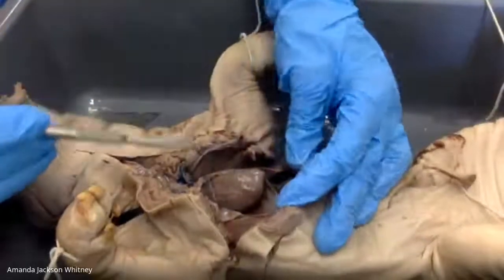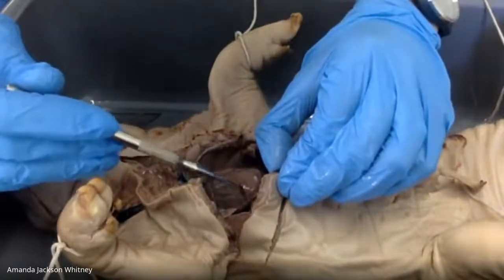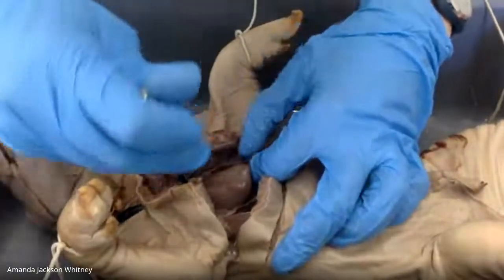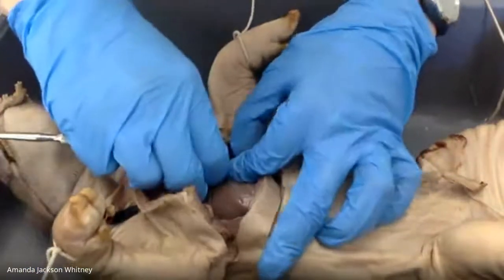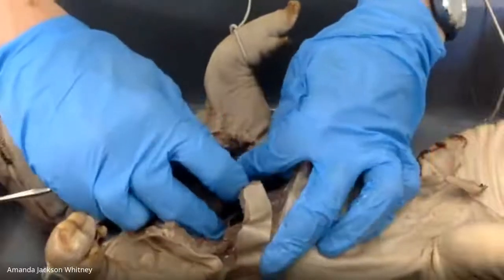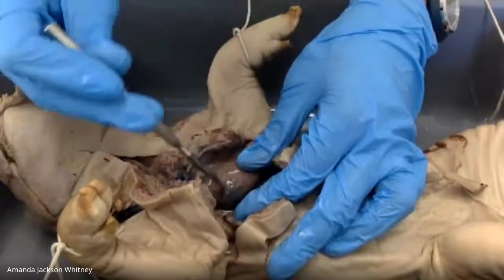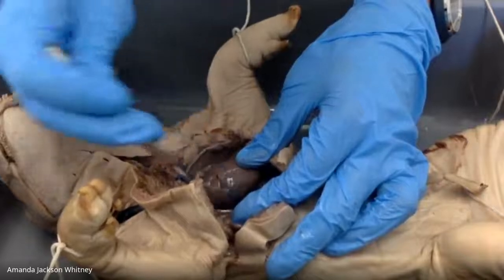And just like the lungs, the heart also has these two layers of tissue that are surrounding it with fluid on the inside to allow for an easier beating process, because remember your heart's constantly beating. If it weren't for the fluid, there would be a lot of friction in the tissues surrounding the heart, which would be very painful, and that is actually a condition people can have. That's pericarditis, I believe, is what it's called.